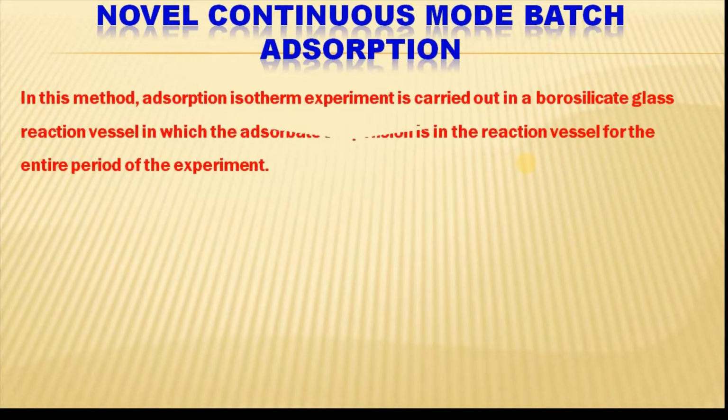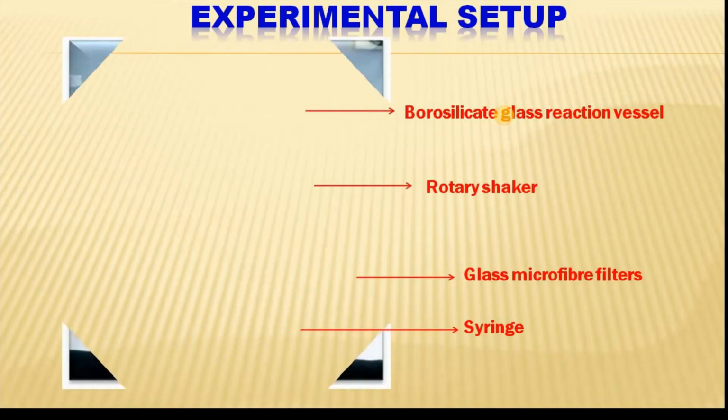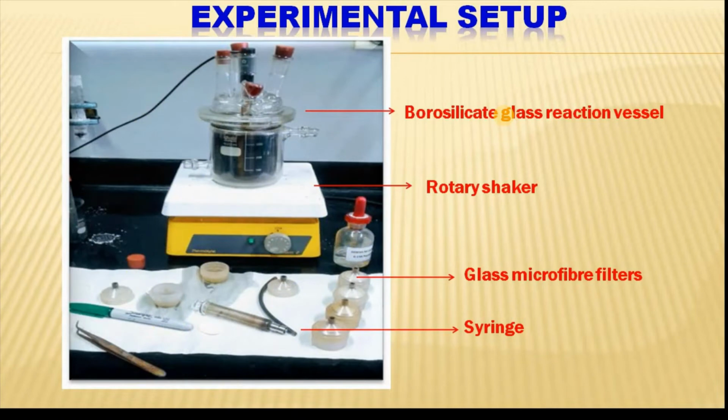Well, we use novel continuous mode batch adsorption method, which has been explained previously. In this setup, we use borosilicate glass reaction vessel in which the adsorbent suspension remains in the reaction vessel for the entire period of the experiment. Then comes experimental setup, which has been explained in my previous video. So we use borosilicate glass reaction vessel, rotary shaker, glass microfiber filters, syringe.